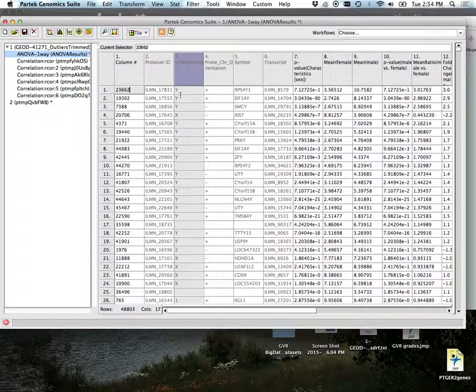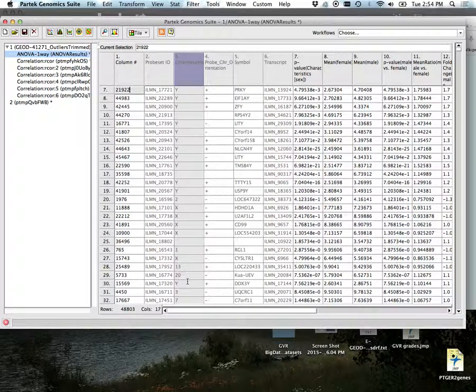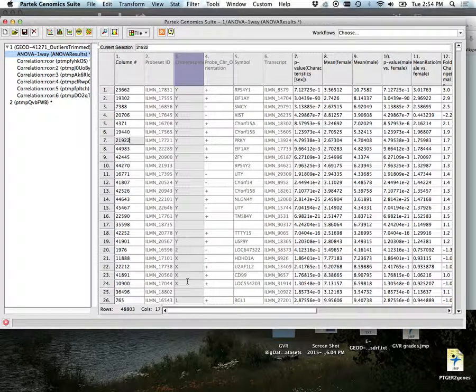Look, Y, X, Y, X. This stuff works, guys. The 2, what is this? Oh, chromosome 2, yeah. But see, this works. You can do things like this to test and make sure that your system is labeled correctly. If you test against males and females and you don't see any difference, then something went wrong. This is a great test for you.